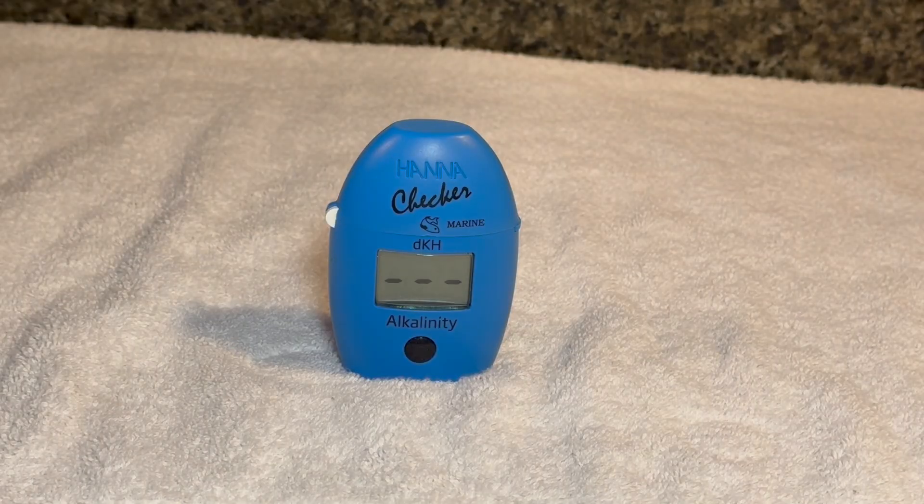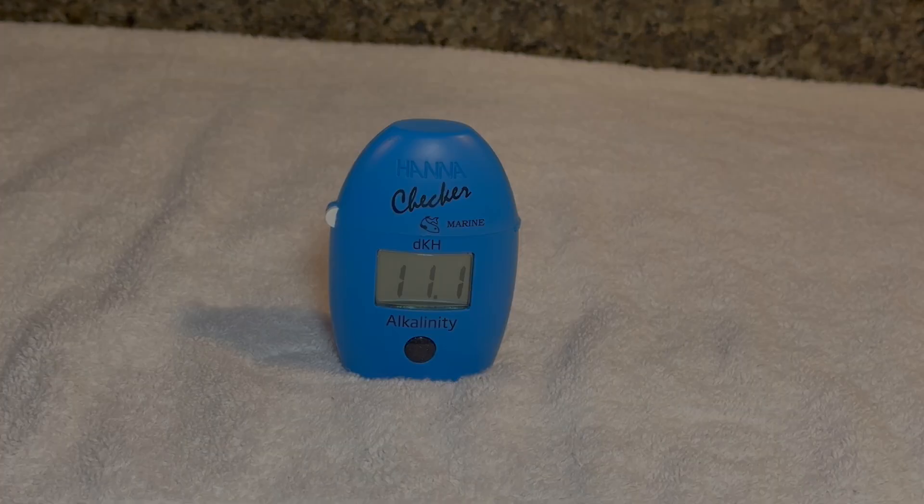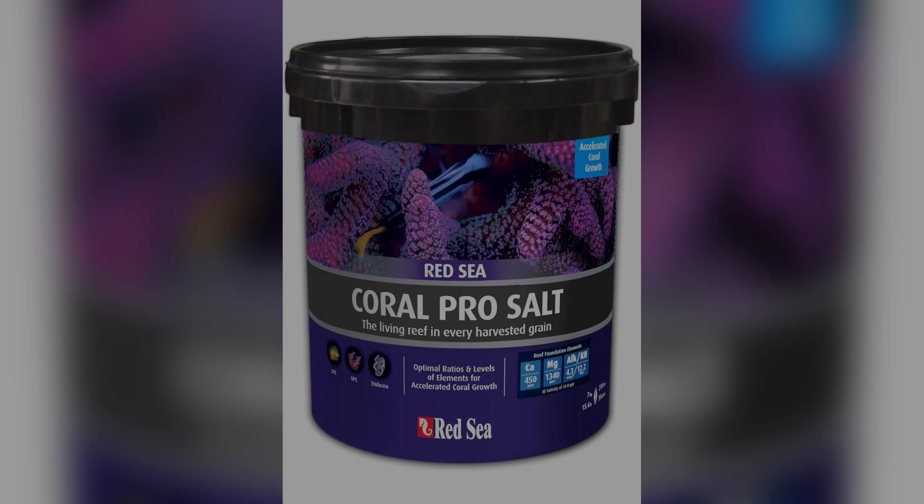This quickly returns a measurement of 11.1. This is a high reading for most tanks. However, it's exactly where I want my DKH to be. That's because this is my Acropora tank, and Acropora grow very quickly at a DKH of 11. It's also the reading given by my salt mix when I prepare new saltwater. This brings us to step one, where we establish stable alkalinity.